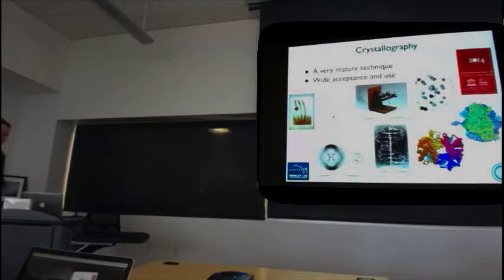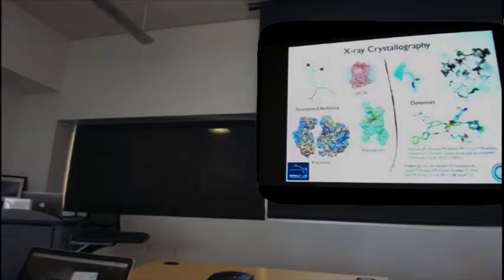And again, I think everybody knows this, and it doesn't certainly need convincing, but X-ray crystallography is a very high information content science. We certainly get a lot of information about the structure of molecules. At the right resolutions, we even get information about chemistry. We can distinguish between atoms. And that's led to a lot of very important, biologically important structures over the years. More and more people are looking at things like membrane proteins and large complexes.